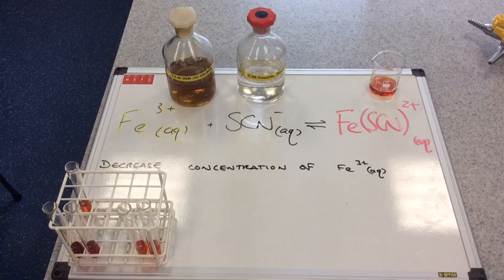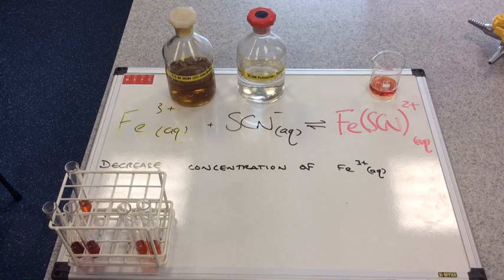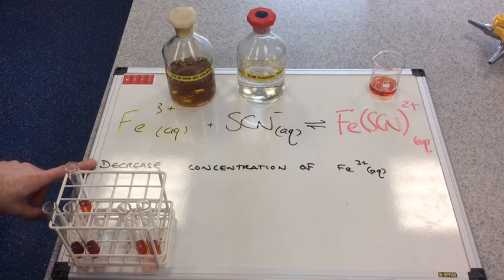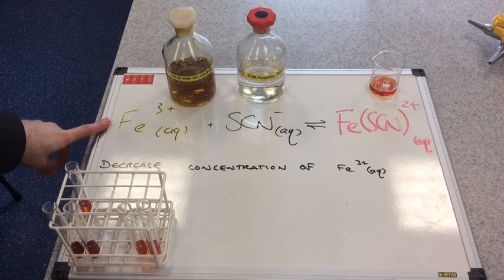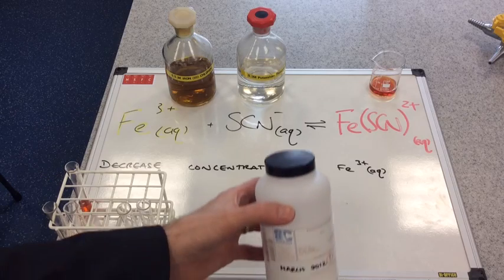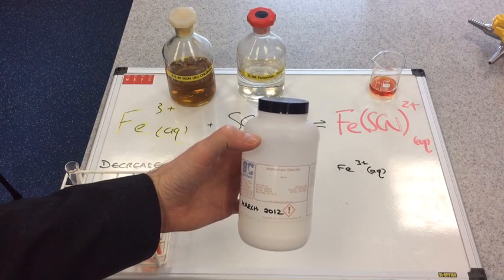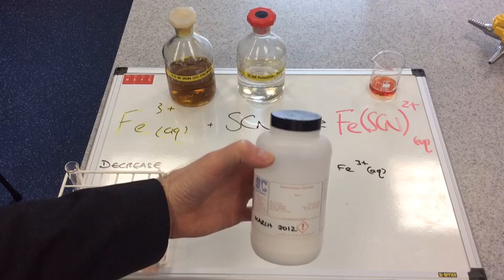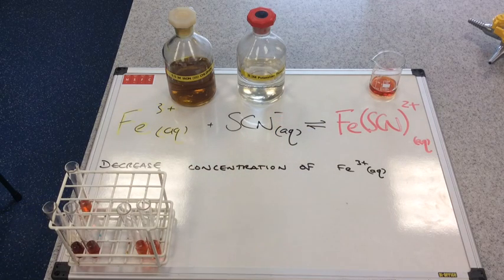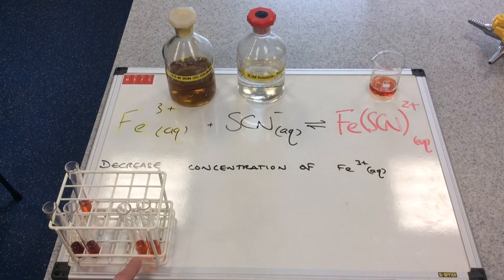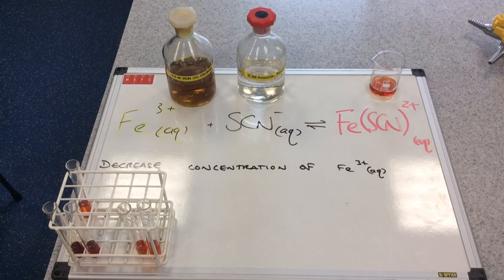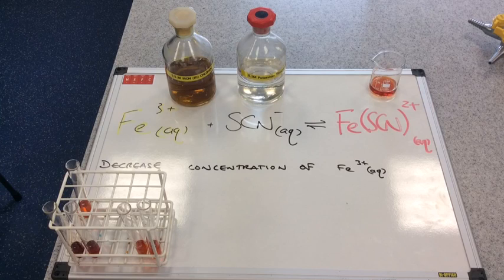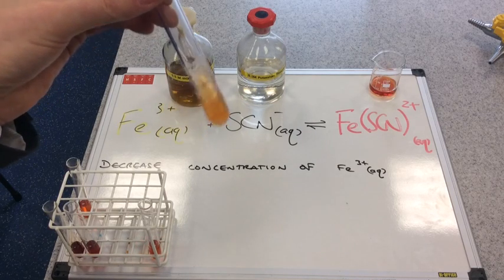The next change I'm going to make to the equilibrium is I'm going to decrease the concentration of iron 3 plus. And I'm going to do that by adding a chemical called ammonium chloride. So I'm going to add a spatula of ammonium chloride to one of my remaining two test tubes. There's the control, still the same as before. And we'll see what happens to the color of the test tube.